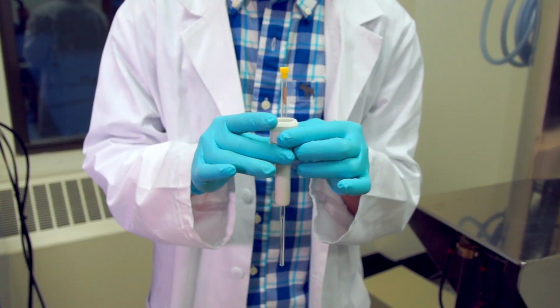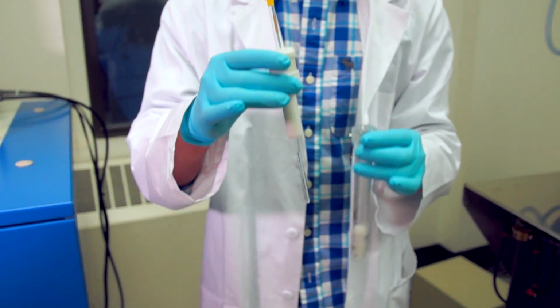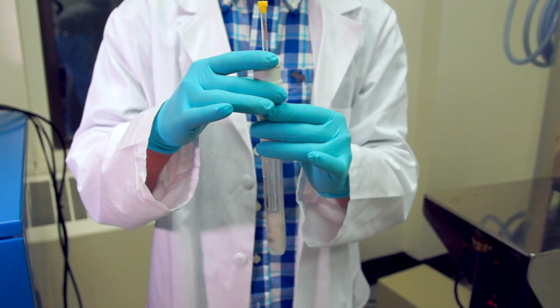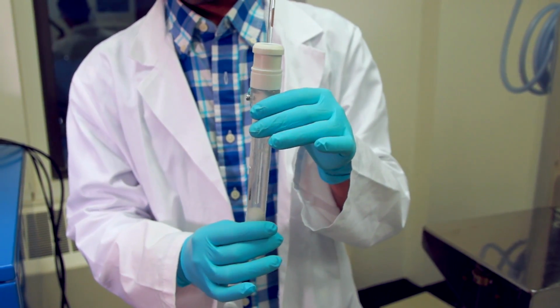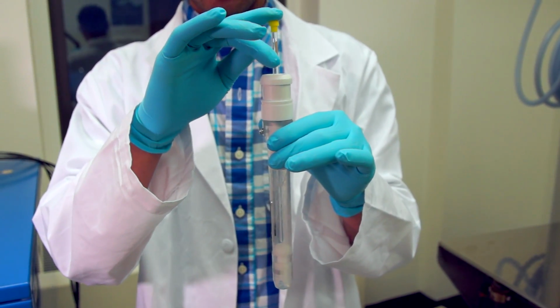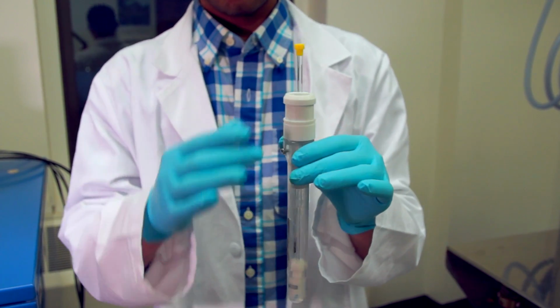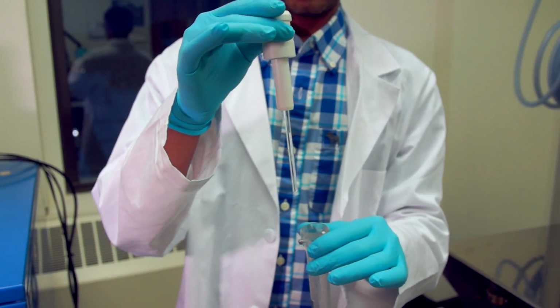Now that you've placed your NMR tube in the spinner turbine, take the NMR gauge and place the spinner turbine inside. The bottom of the NMR tube should hit the plastic, because this is the appropriate level for your NMR machine. Then take the spinner turbine and remove it from the NMR gauge.